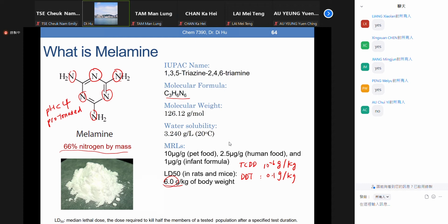Because melamine has been added into food, into dairy, baby formula, pet food, and human food, to falsely represent protein level. The global standard method to measure protein content in food is the Kjeldahl method, and it cannot differentiate whether the nitrogen is from protein or something else.